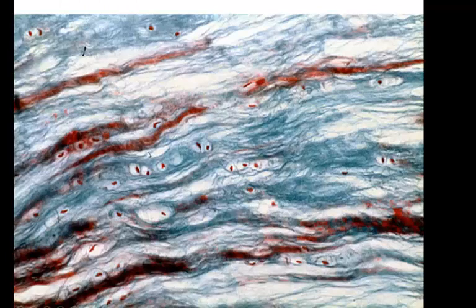Now, see, this is not smooth at all, is it? I see my little eyeballs looking at me everywhere. There's a little set of eyeballs right there. This is fibrocartilage. The biggest indicator that you've got fibrocartilage is that you can actually see collagen fibers. Now, back here in hyaline cartilage, we do have collagen fibers, but they're so fine that you can't see them in this matrix.